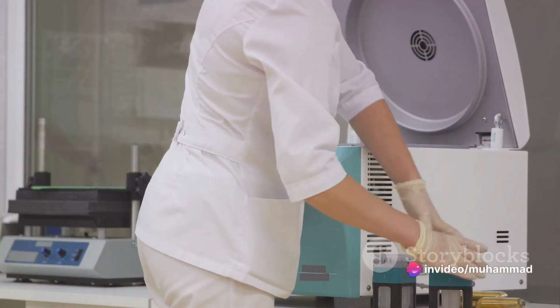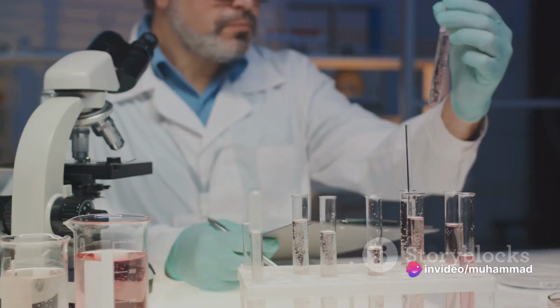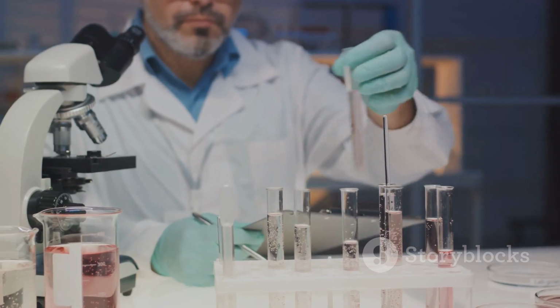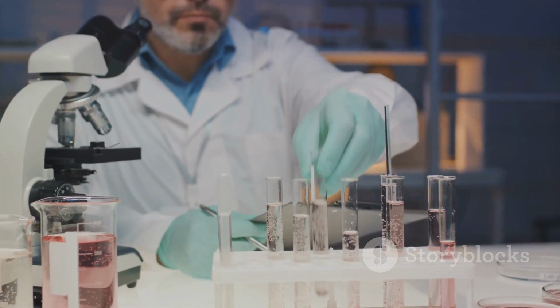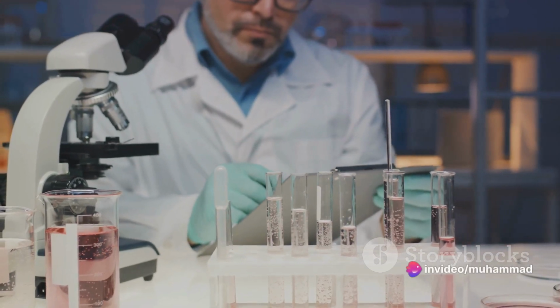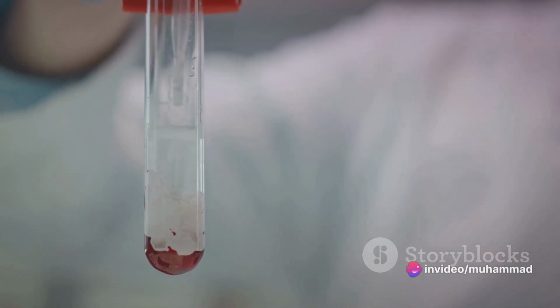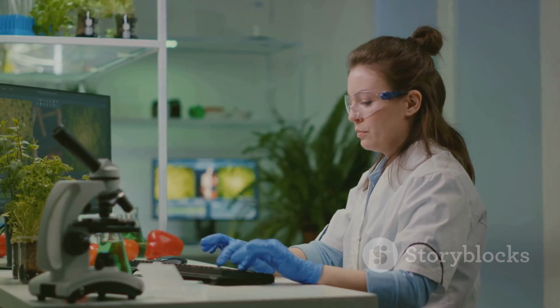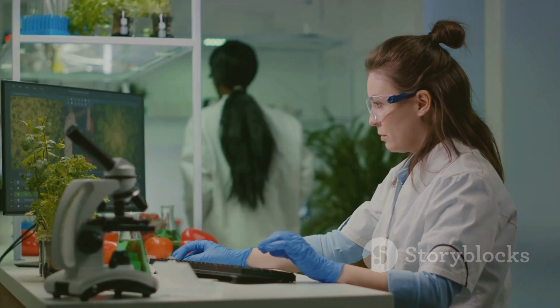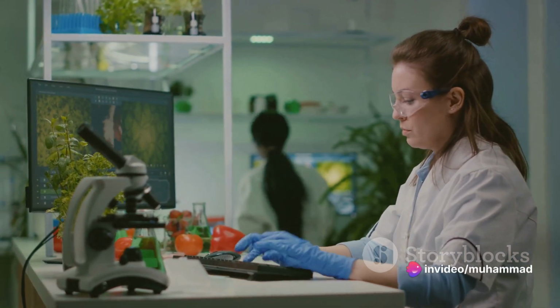So let's take a step back and look at the bigger picture. We've explored the world of chromatography, from paper and thin layer chromatography, great for quick and simple separations, to gas chromatography, ideal for volatile compounds. We've also delved into high-performance liquid chromatography, perfect for separating components of a solution, and finally, column chromatography, the go-to for large volume samples. Each of these techniques has its own unique characteristics and applications.